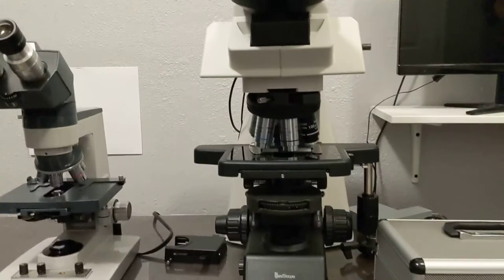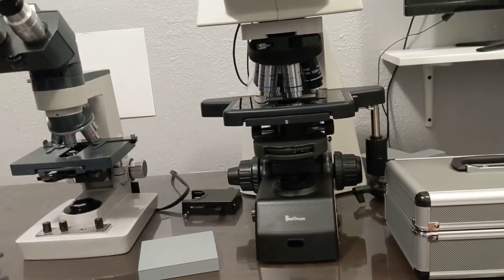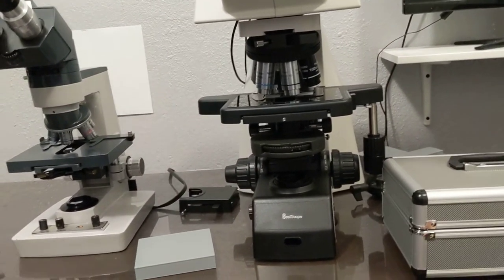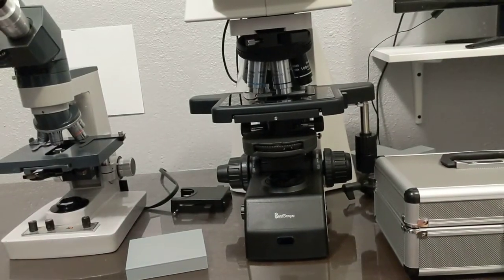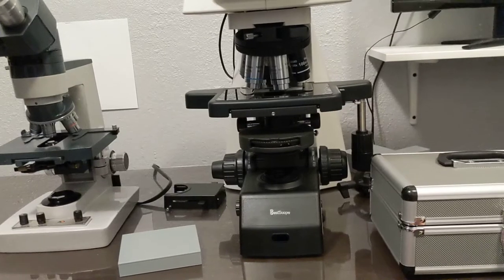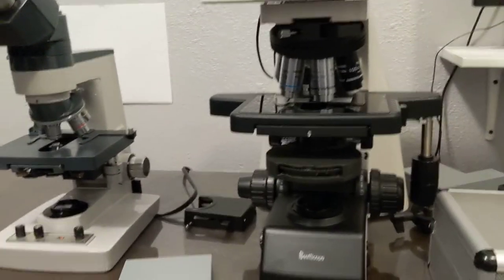I'll show you what that looks like on the back end. It's got a dovetail here that you unscrew. This will pop right out and unplugs from there. You can exchange illumination systems. They do sell a halogen and an LED. Even though they're physically interchangeable, the electrons inside the microscope need to be set up for one or the other. Once you choose LED, which is what I did, you're stuck with LED.